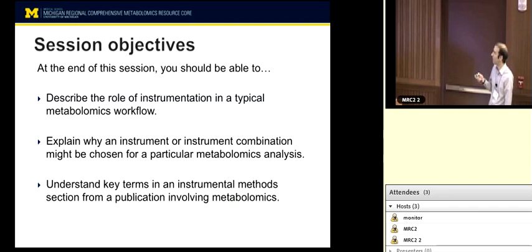Instrumentation came along, LCMS-based proteomics, shotgun proteomics, and we're able to do much more comprehensive protein analysis. Initially that started in just detecting proteins, and then it moved to quantitation of proteins and protein turnover, and all sorts of other things have been enabled by proteomics.